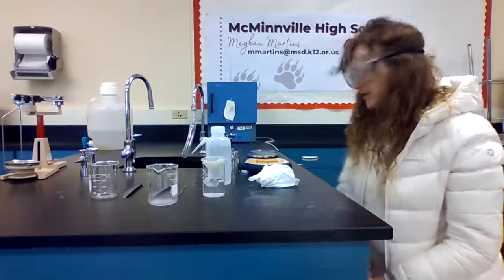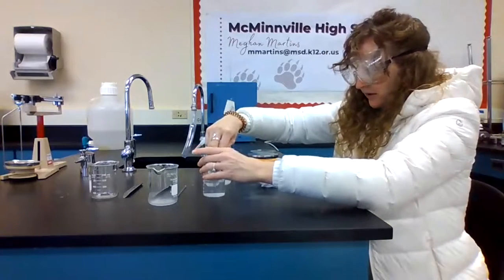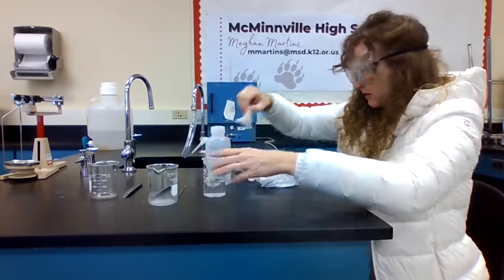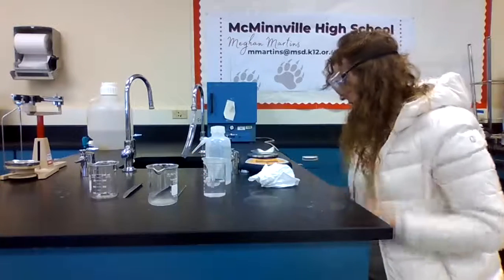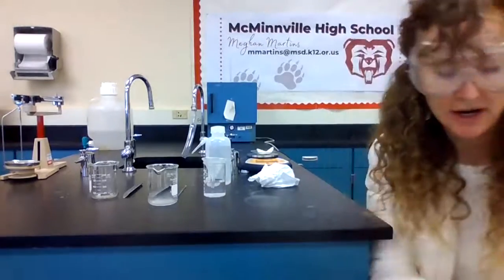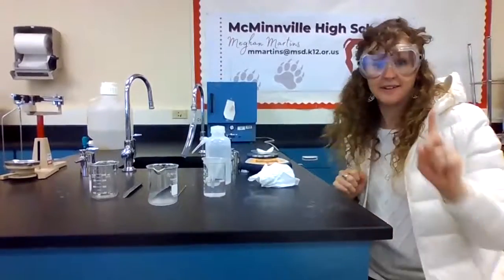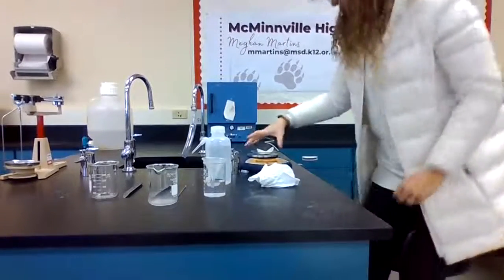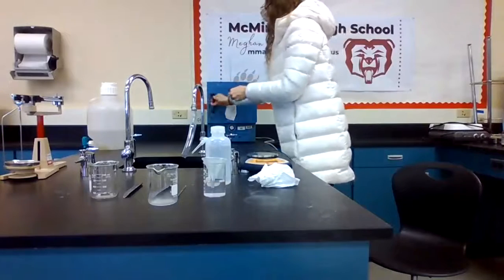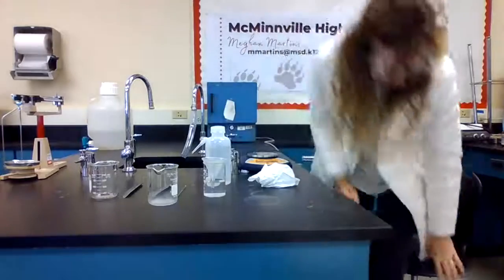Okay, I'm going to zero the watch glass. .4 grams. Now we'll put it in the drying oven. And we'll check it in 10 minutes.